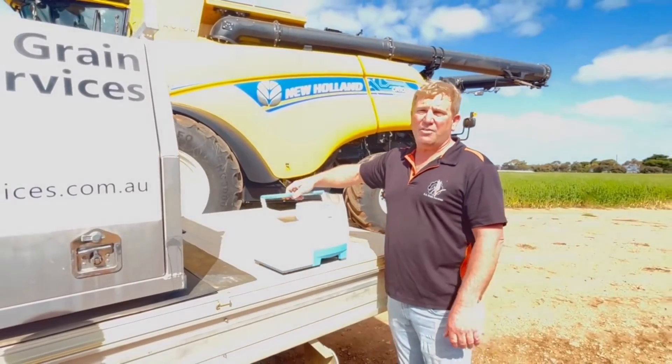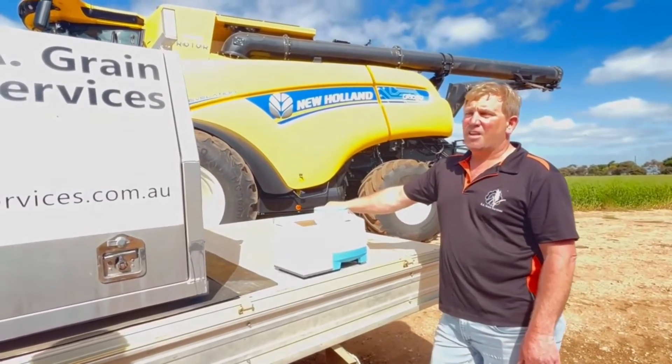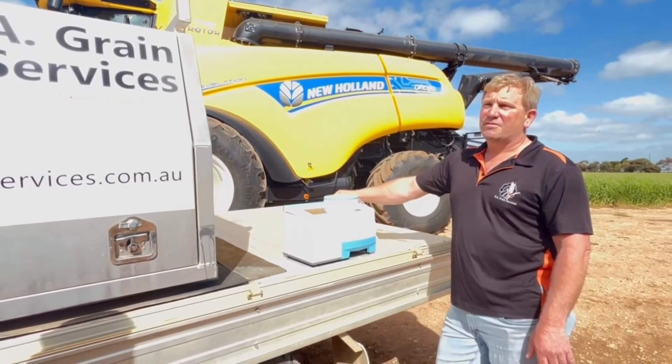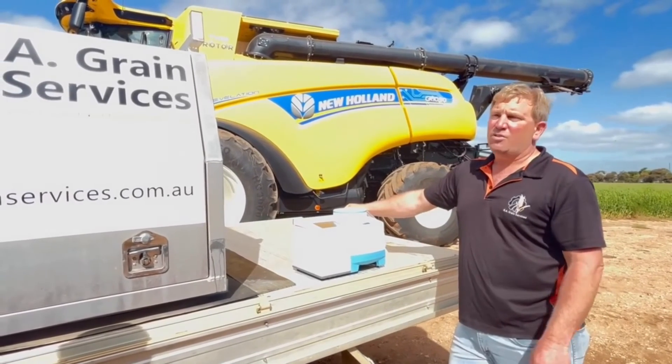It comes with a bag as well if you need it. The battery lasts approximately two hours depending on how often you use it. You might only need to charge it every week or two.